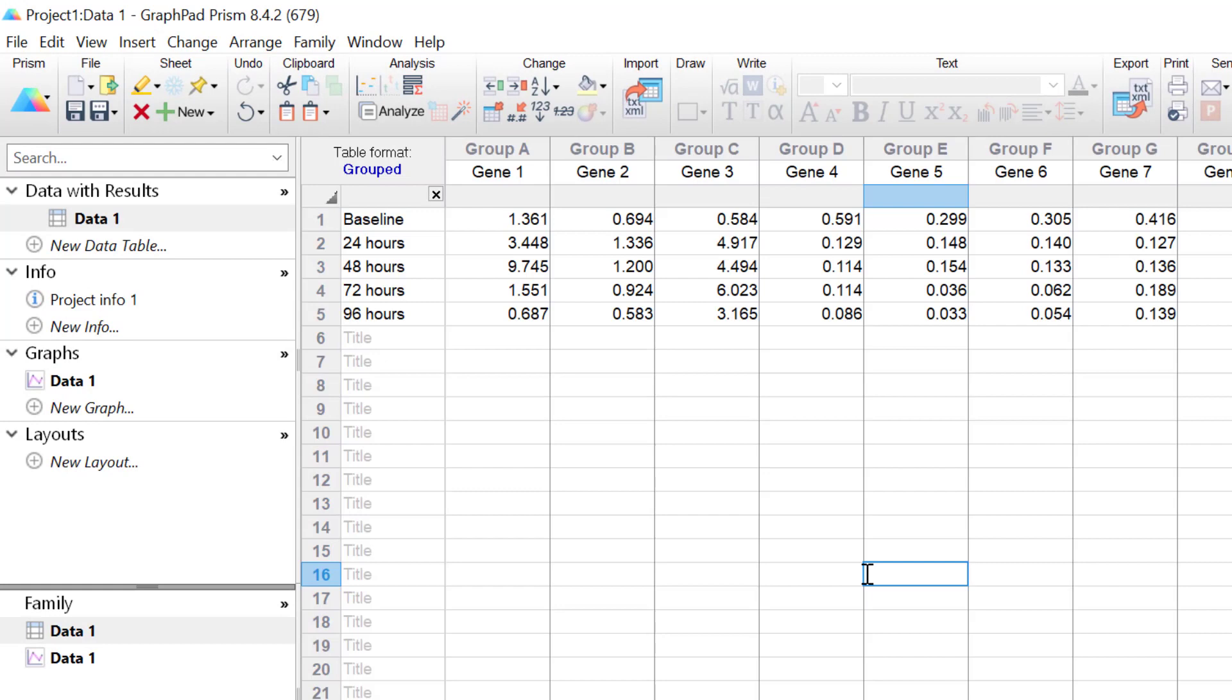This data comes from a series of cell culture experiments. I have gene expression data for 13 different genes, which are entered into the different columns.